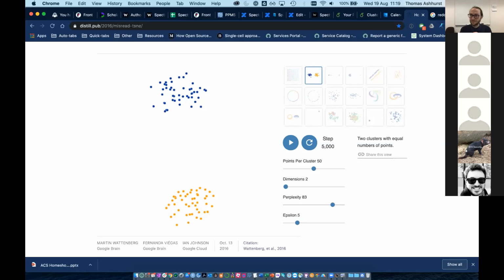Well, maybe you can just get it to sort of determine the number of metaclusters first. Look at it in the UMAP or the tSNE plot, see if it makes sense, and see if you want to add more clusters or reduce it. It's just a starting point. Yeah, that's a good idea, actually. Let it give you an idea of what you might be doing. Yeah.